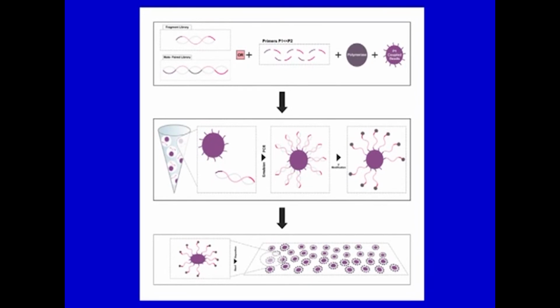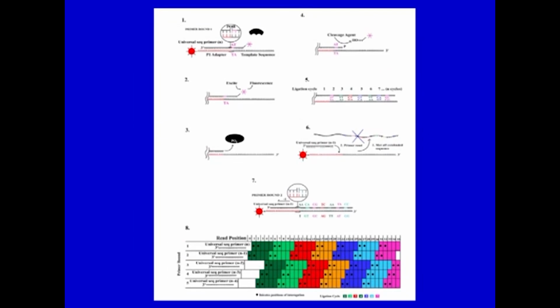This is like beads here on which it is attached and PCR is carried out, and this is the real reaction here where priming and ligation are 2 methods. So, what is done, if you can see on the screen, there is an adapter and there is a primer against that. Now, this fragment, which is the probe you can say, has fluorescent material in here. So, this will be matching, and after the primer it will sit in here, and these are various probes in here.